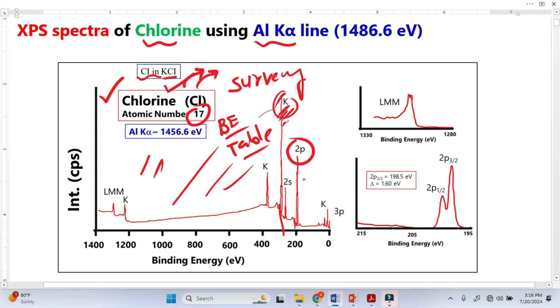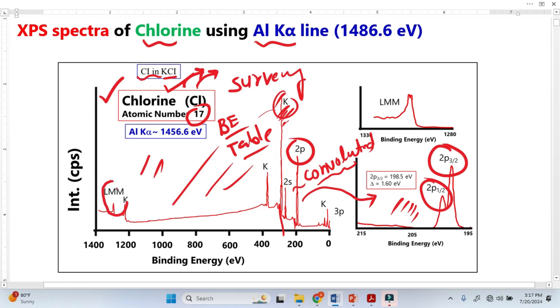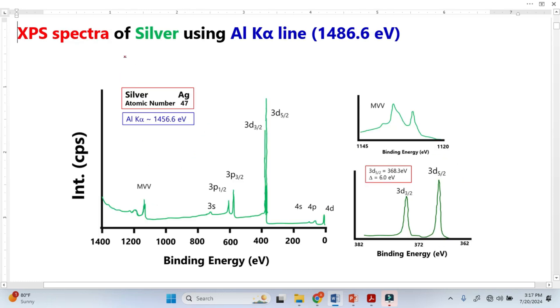The 2p peak is very important. It is currently convoluted — meaning it is a mix of two peaks. We need resolution, so when we resolve it, this peak looks like two separate peaks: one peak here and another peak here. This spectrum is what we call the high resolution spectrum. Similarly, we also take the important Auger electron peak, and when we apply high resolution, it also appears as two peaks.